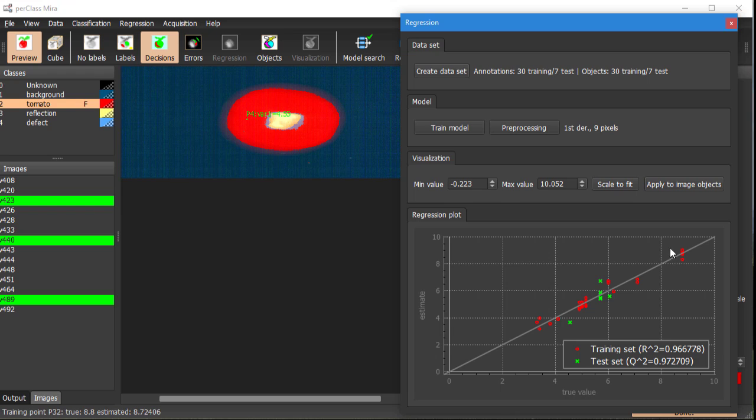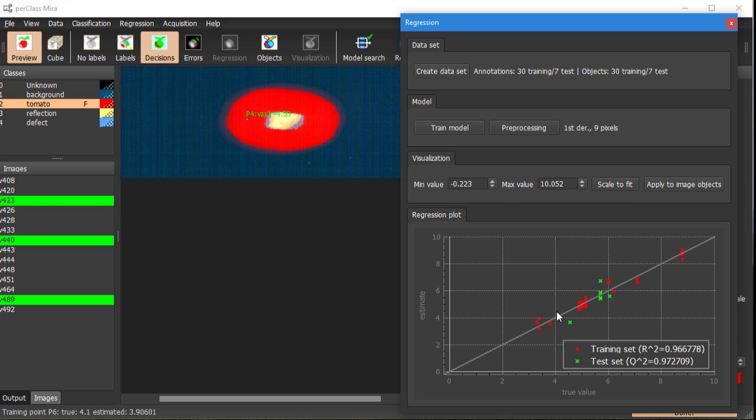This is a much better picture. That's what we want to see. We are actually getting a high value of q-square statistic. So it looks like that we have a nice model. What can we do with this model?